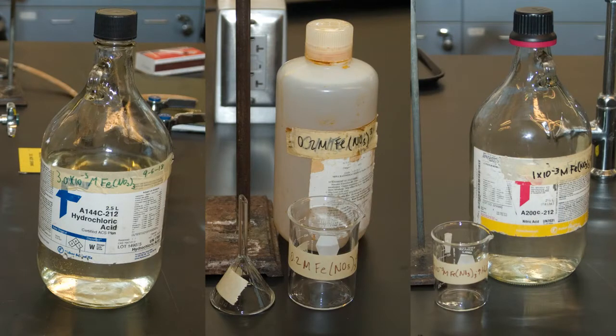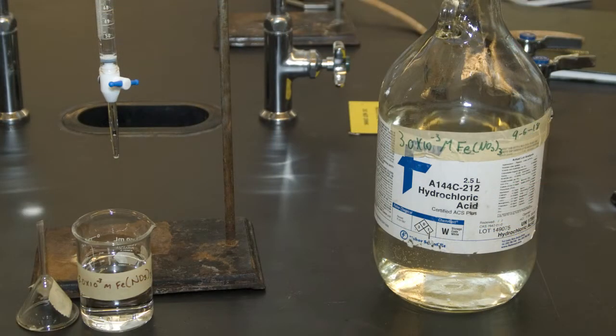Helpful hint. There are three different concentrations of iron-3-plus used in this experiment. Make sure you do not select the wrong concentration, as it will cause extremely erroneous results. 3.0 times 10 to the minus 3 molar is used in Part A.